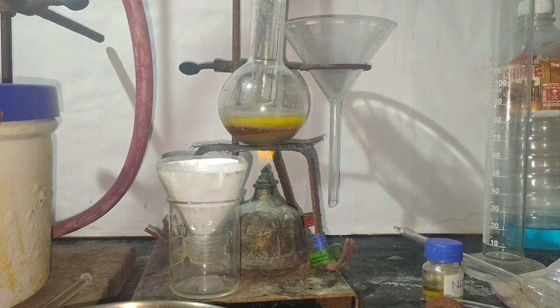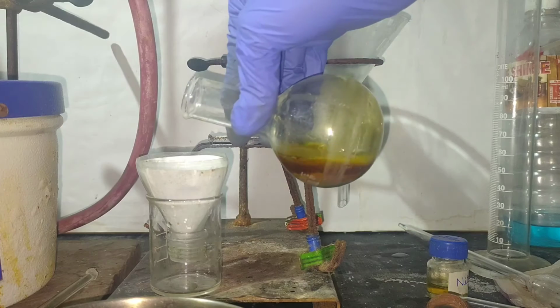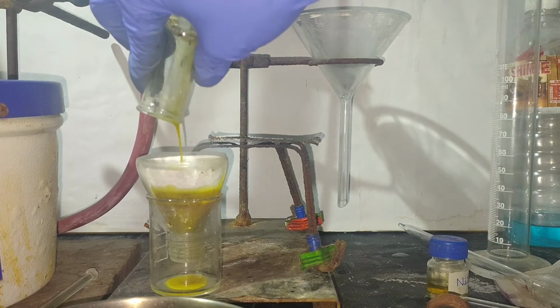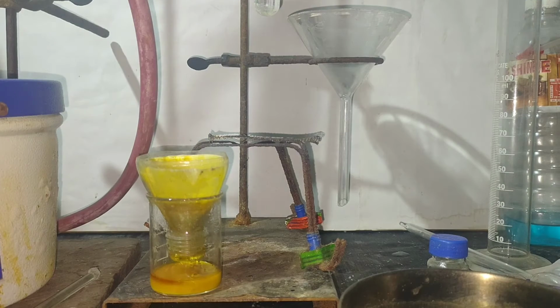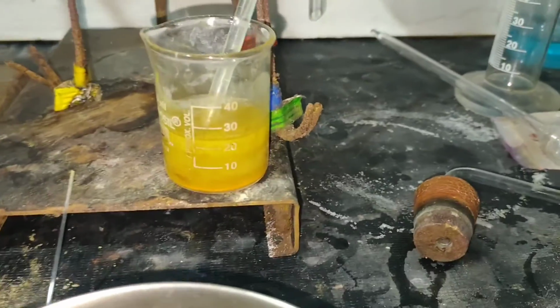The solution should turn yellow and then colorless, but it was not happening in either case. I filtered the solution hot when I observed that the reaction had stopped and washed the residue with hot ethanol. But this was only an oily layer that formed at the bottom and it did not solidify. It was yellow in color. It seems that aluminium hadn't reduced nitrobenzene completely.